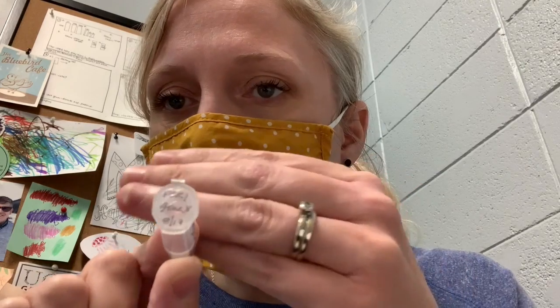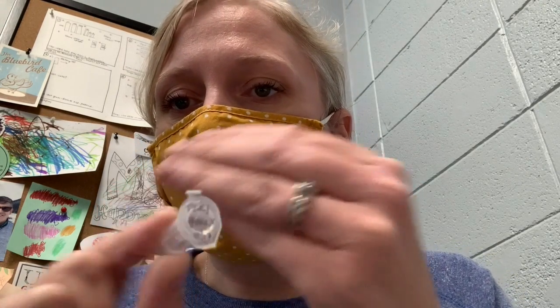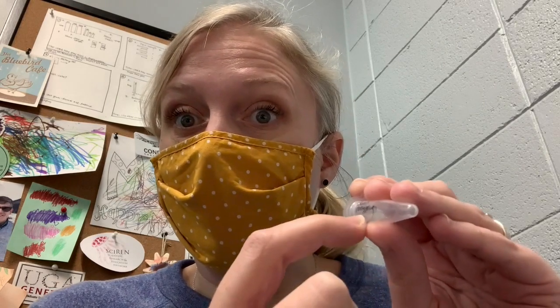So I have an example of, this is like a PCR product. I've just labeled a tube how I would label it. It says PCR1, gene X, and then the date on the lid. And then on the side I have my initials, and then I'm pretending I've taken the concentration of this with the spectrophotometer, and I would write that concentration on the tube too.